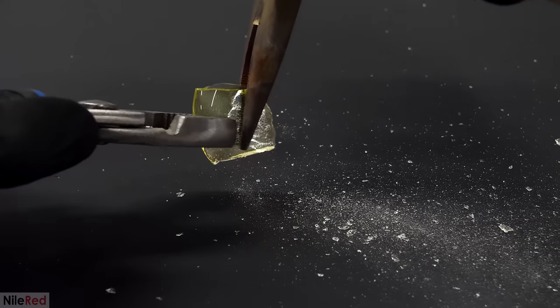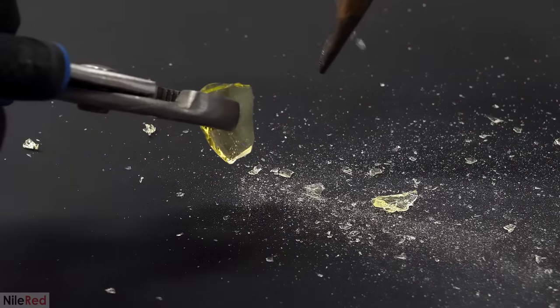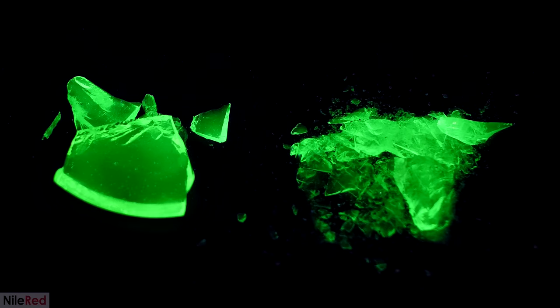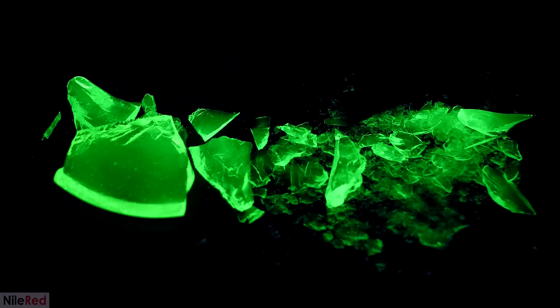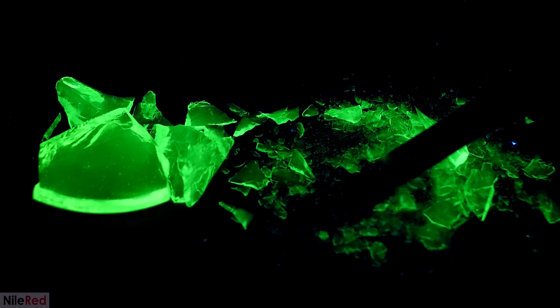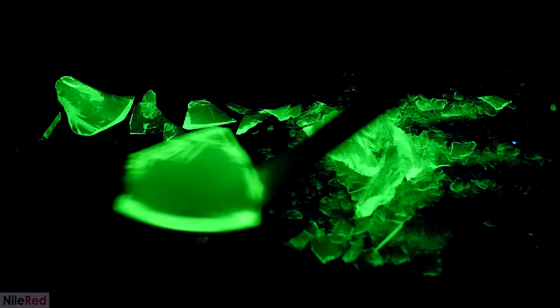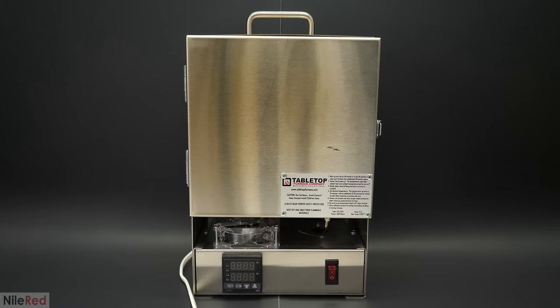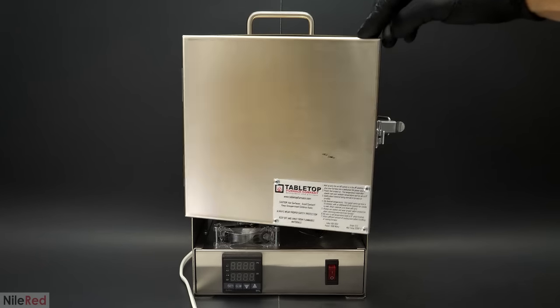I decided to try breaking a piece with pliers, and it was surprisingly difficult. The moment it did break though, it just exploded from all that internal stress. I thought this was really cool, but what I wasn't a fan of was all the powdered uranium glass dust that was flying everywhere. After doing this, I realized my only real option was to anneal it. To do this, I'd have to hold the glass at around 450°C for several hours. At this temperature the glass is solid, but still liquid enough that its atoms are able to move around, letting them move to new positions and reduce the overall internal stress. This is the proper way to do things, but I was trying to avoid it because I only had one furnace.